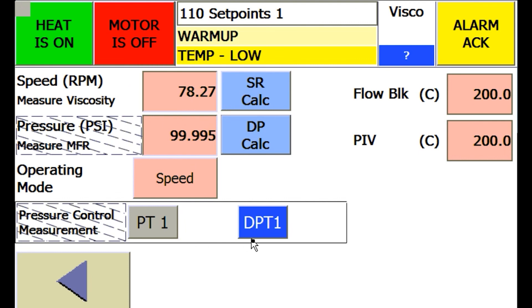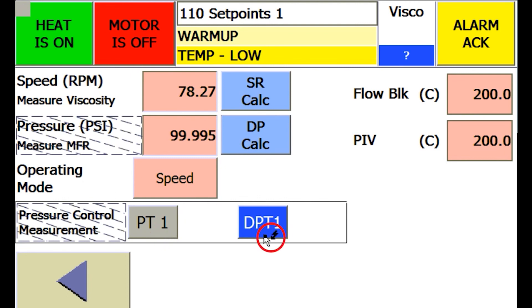Also, in dual pressure sensor or dual capillary systems, you'll see several ways to control pressure, either to just a single pressure sensor or differential across the capillary. In most cases, you'd want to run the differential pressure, if available, with a two-pressure sensor or two-capillary system.